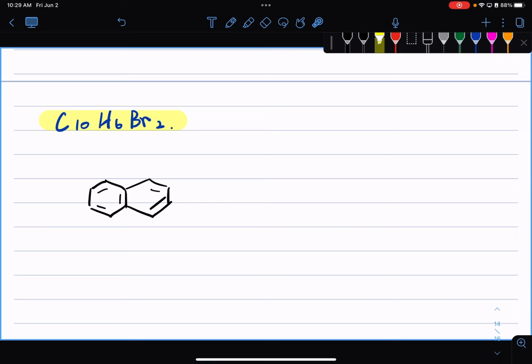So my bromine must be put in relatively symmetric positions, right? So you can rule out some of the possibilities, like this one. This one is probably not right because it does not have any symmetry, and in your carbon NMR, you would expect many more peaks if we put the bromine this way. So carbon NMR is telling us information about symmetry.